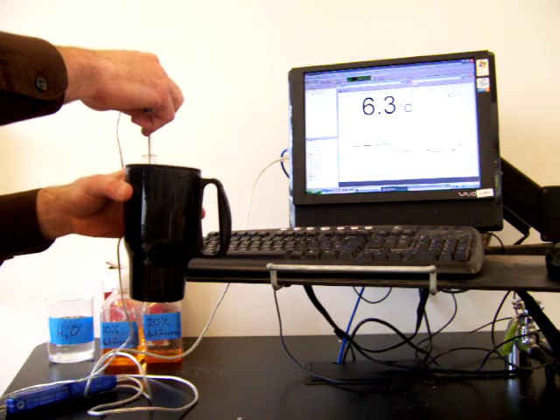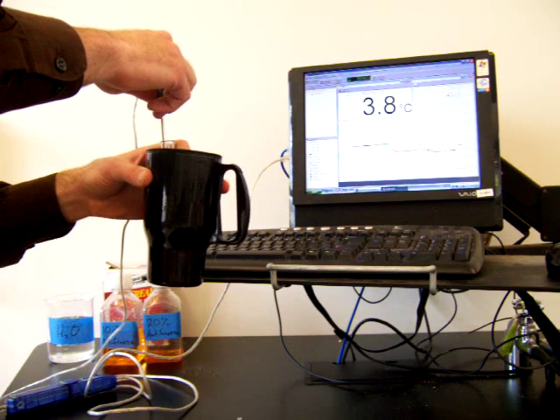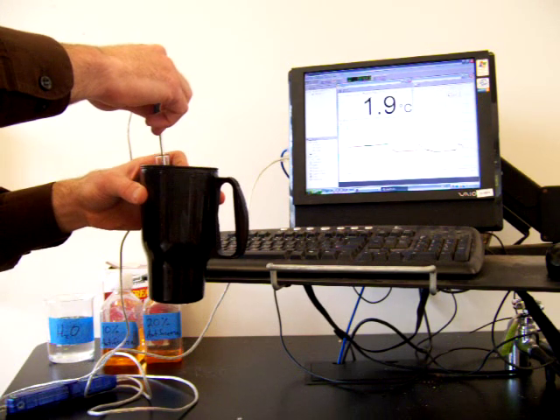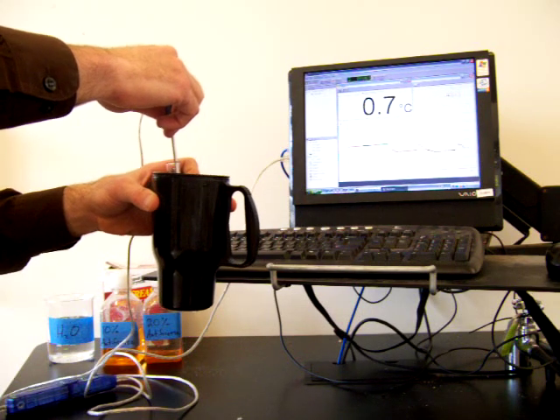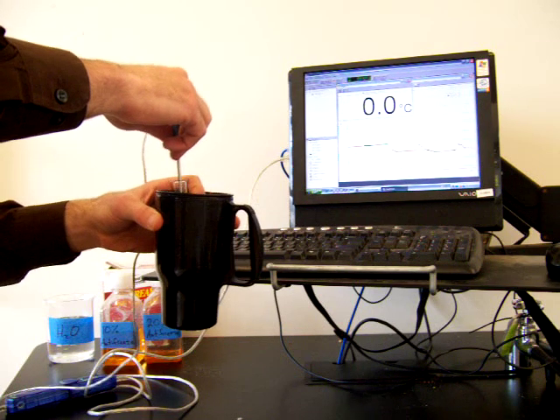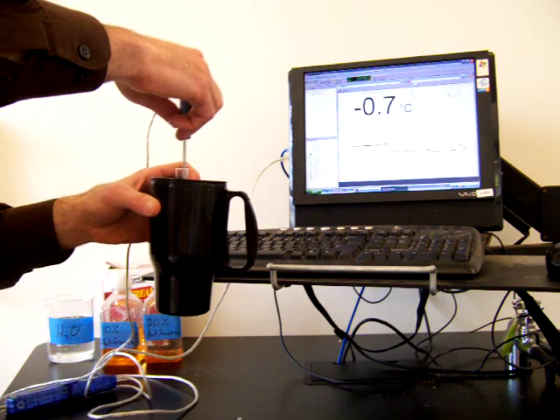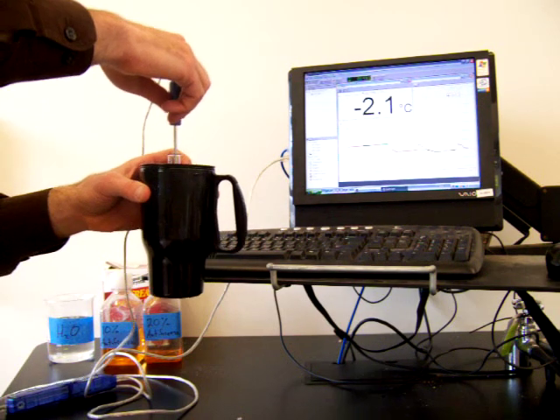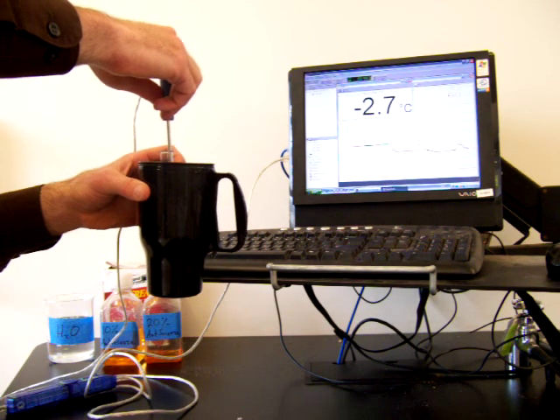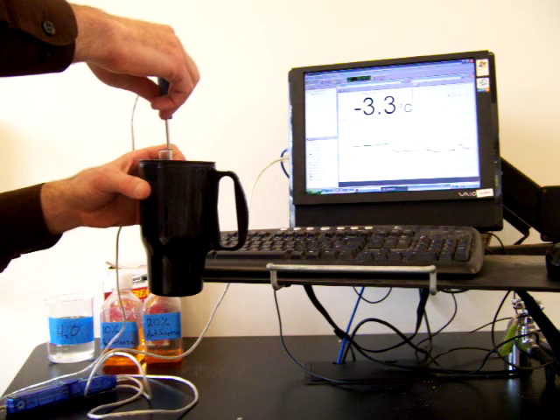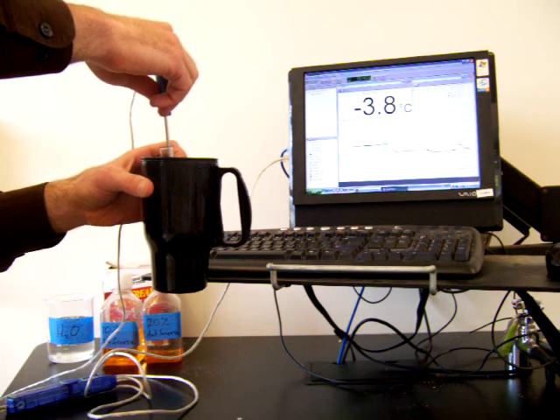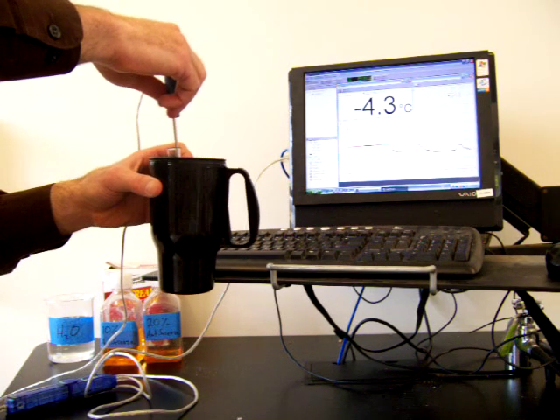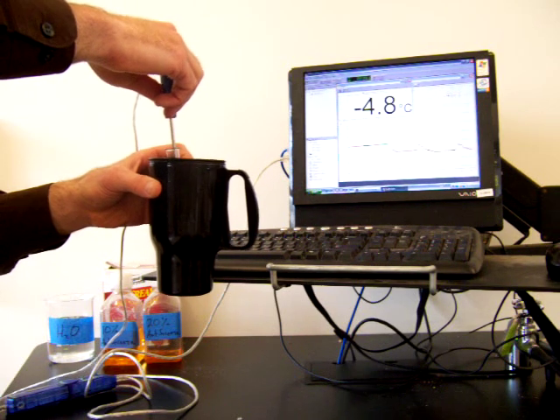This one was made by dissolving 20 grams of antifreeze in 80 grams of water. And we just took a small sample of it. We didn't want to freeze the full 100 grams of solution. So we've got the thermometer in the antifreeze solution. We've got the antifreeze solution in our ice bath that's been covered in salt to bring the temperature down even lower than if it were just a plain ice bath.